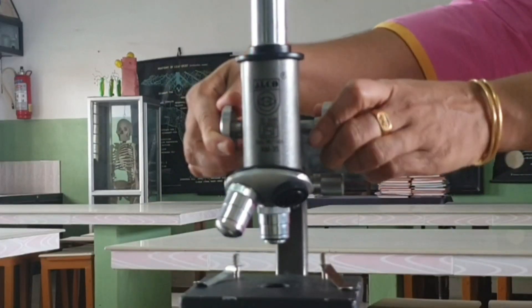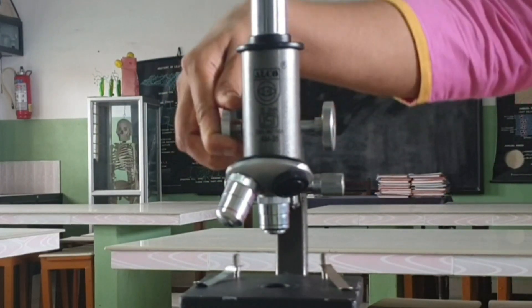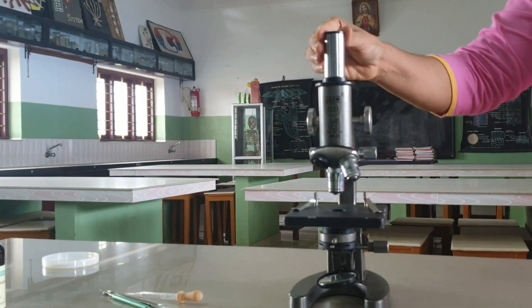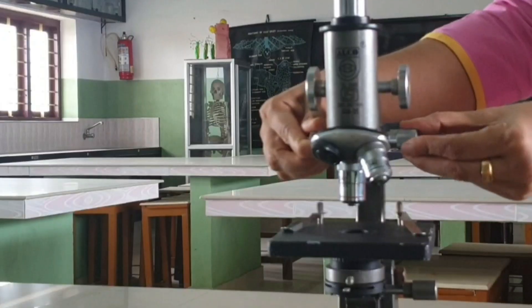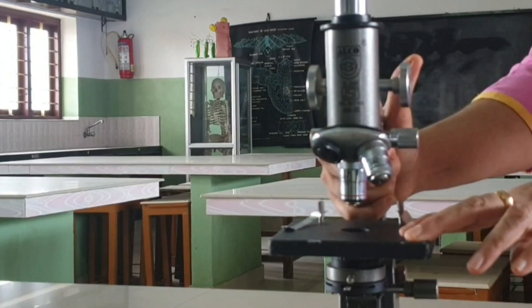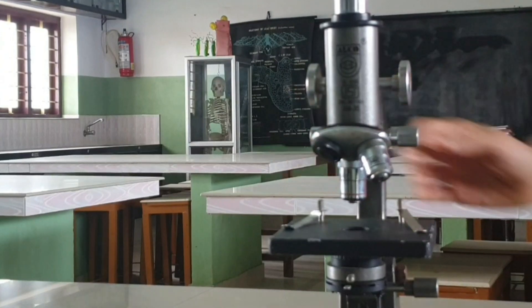Coarse Adjustment Screw: it is a bigger sized screw that can move the body tube up and down for focusing. Eyepiece Lens: fitted at the top of the body tube, through which the magnified image of the object is seen. Fine Adjustment Screw: it is a smaller sized screw for very slow movements, needed for fine and sharp focusing.